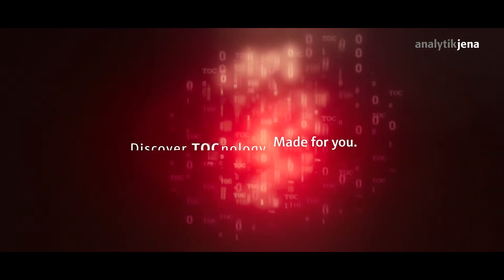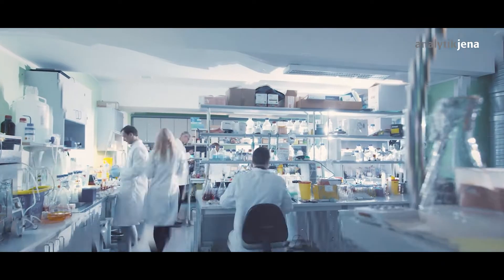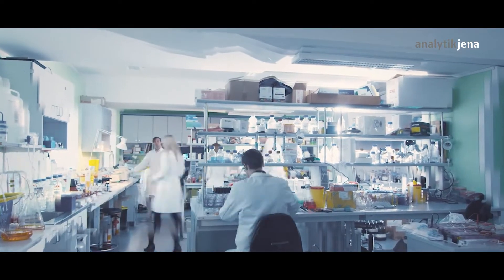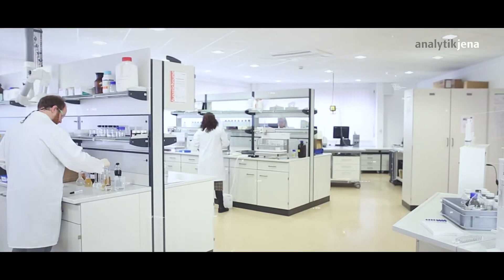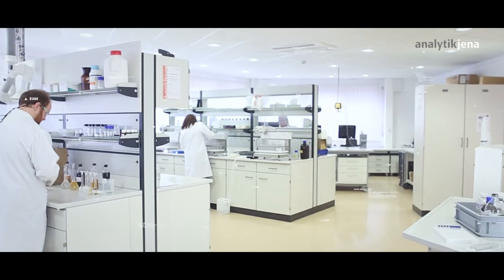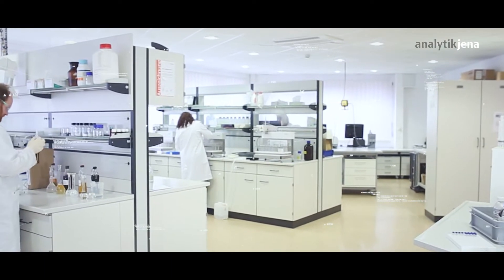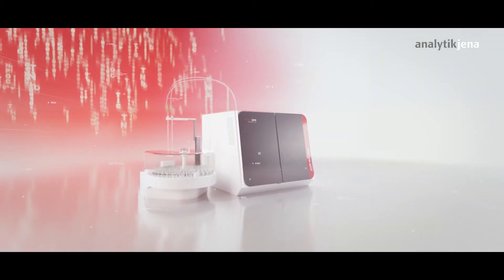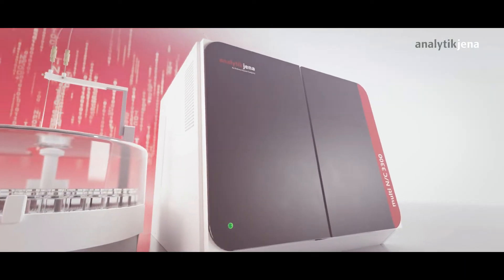Discover the Multi NCX300 series from Analytic Jena, a new TOC TNB analyzer that takes the strain out of your lab routine. An analyzer that gives you more time for what really matters.